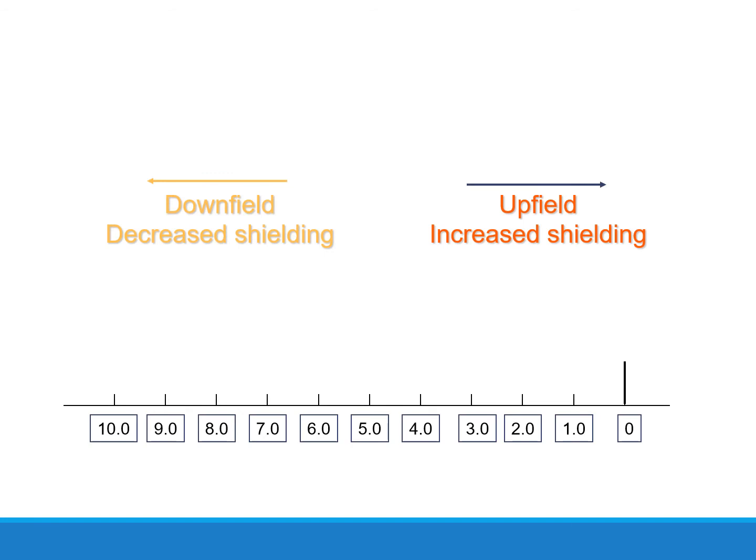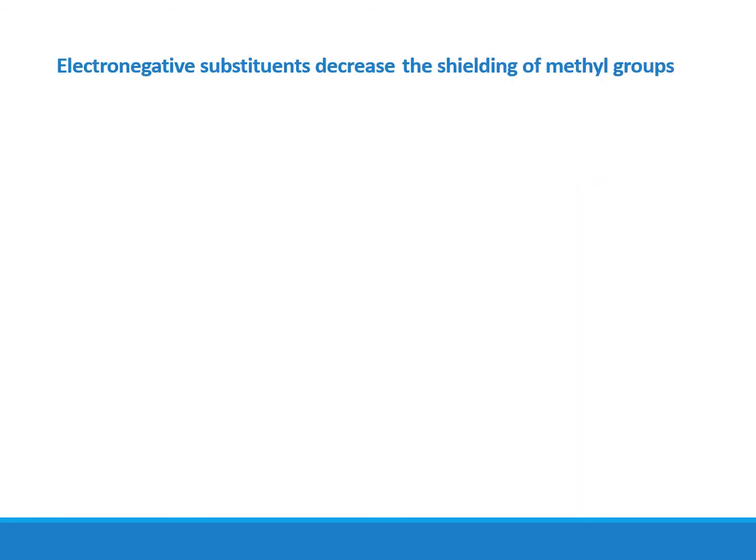So in NMR, compounds that have less electronegativity difference in their bonds will be highly shielded and appear to the right side, near the reference compound, tetramethylsilane, whereas compounds which have highly electronegative bonds will be deshielded and appear to the left side of the chemical shift reading.